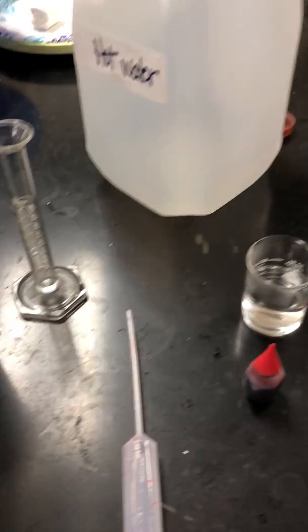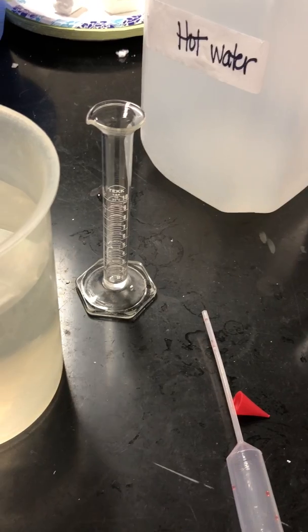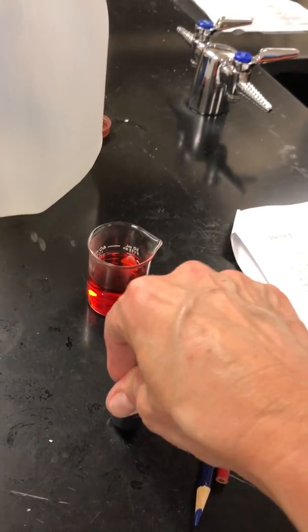All right. It says to put 2 drops of red, and look at the diffusion, because you know we heated those particles, so they are moving fast. They stirred themselves. Nice.